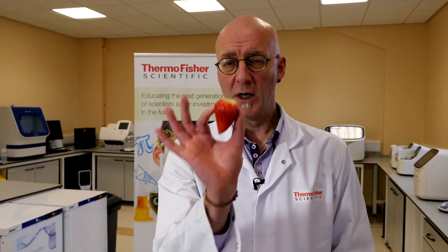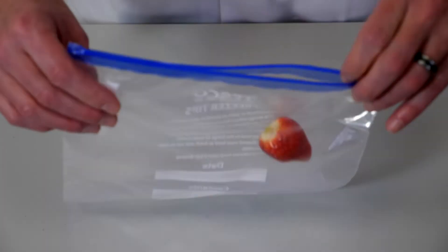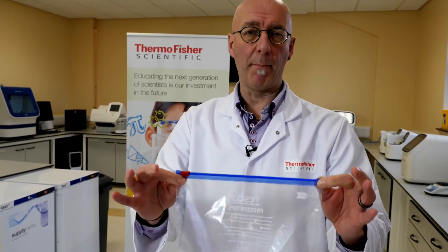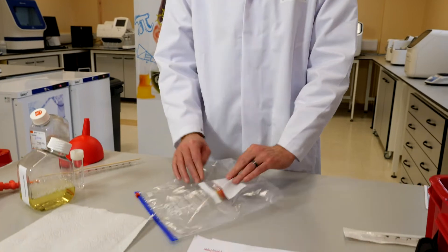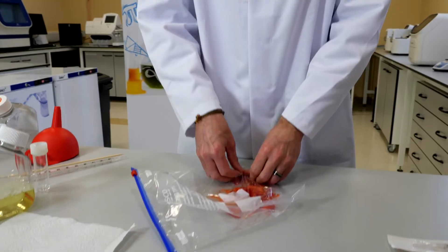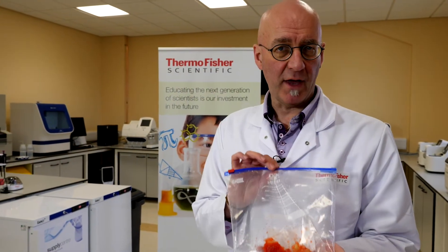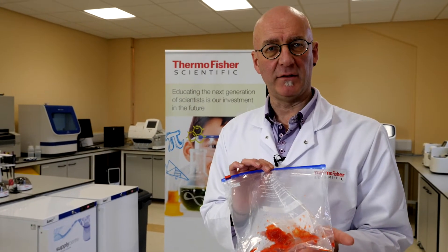We're going to take our strawberry and remove the leaves. We're now left with our de-hulled strawberry. We're going to open our bag, pop the strawberry in, and make sure we zip the bag back up. Next, we're going to crush the strawberry with our hands — all you need to do is crush it so that it looks like that. What we're doing is starting the process of extracting the DNA.